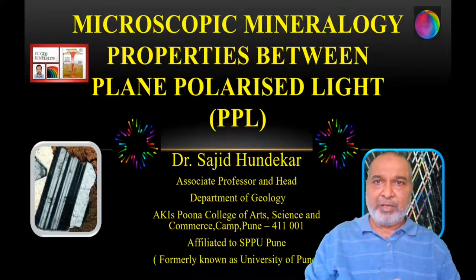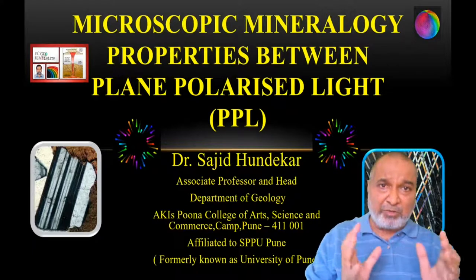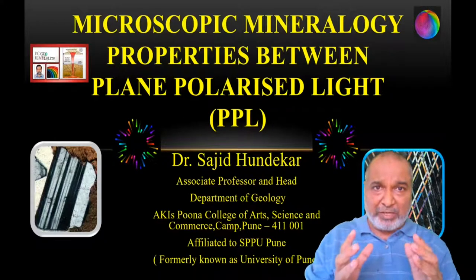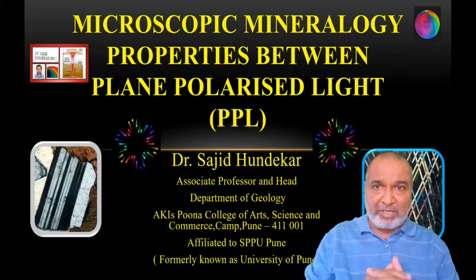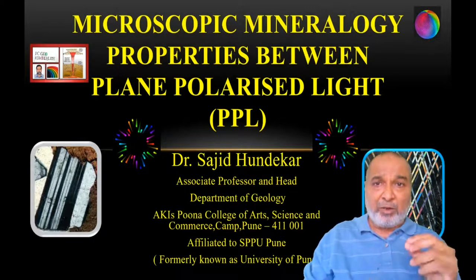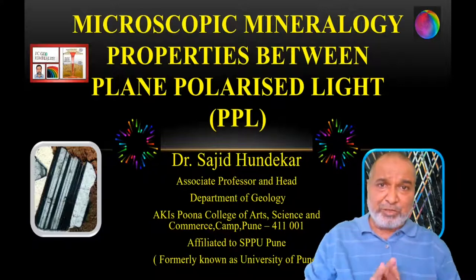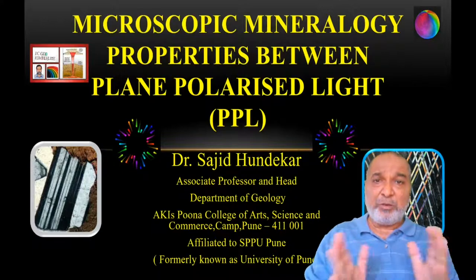Hi friends, today we are going to study practically how you are going to find out the properties in plane polarized light, that is called the properties in PPL. This is one of the topics from microscopic mineralogy. Whenever you see a mineral under the microscope, these are the basic properties we have to identify on the basis of plane polarized light, which we are going to see today, and in the next session we are going to see the properties in cross nicol.